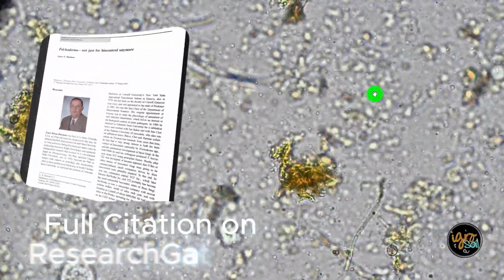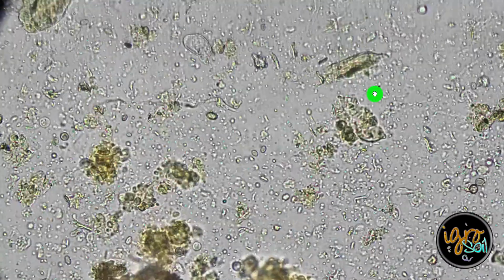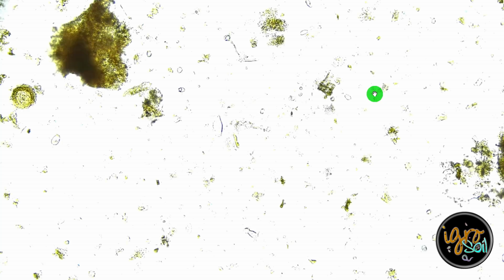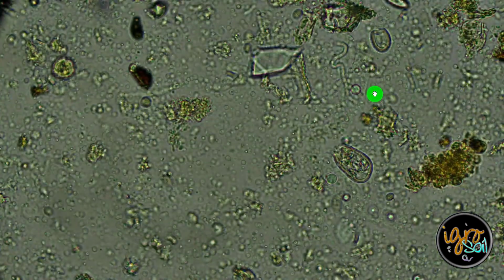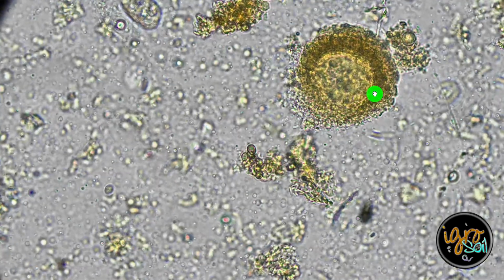I went a little deep on that one with trichoderma, and I came out at the other end knowing less, because sometimes you start compounding all this information and I just kind of go blank. All right, so I'm gonna get to 100 here. I'm comfortable knowing that most of this sample is going to be the same as far as all the same biology. Well, not the same, but unless something jumps out at me, let's light that up.